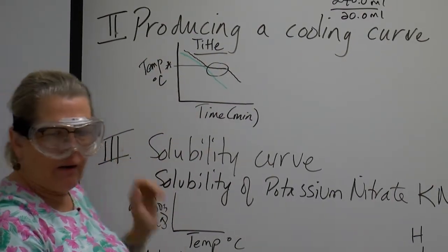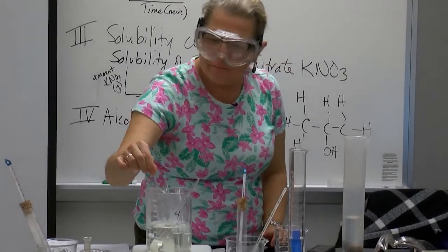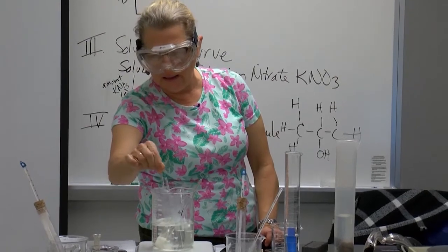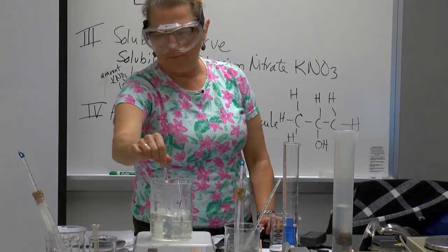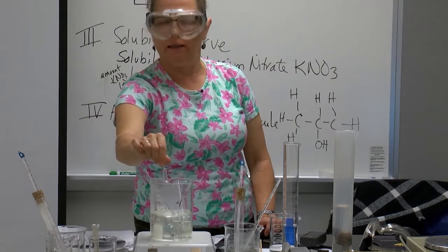Let's see how our solubility curve is going. We've got the 10 gram one almost completely dissolved, but the 15 gram, I need to work on that a little bit. So I'm going to stir the 15 gram one quite a bit.